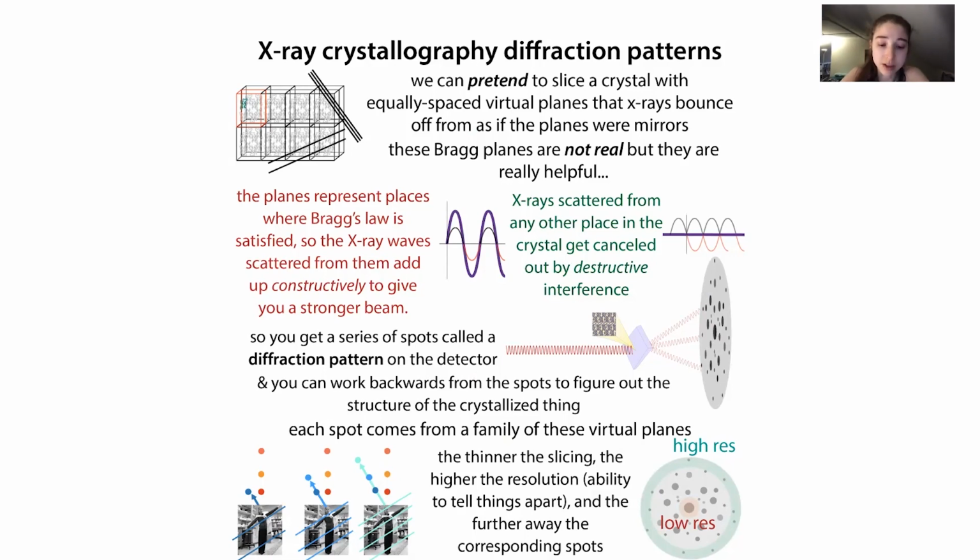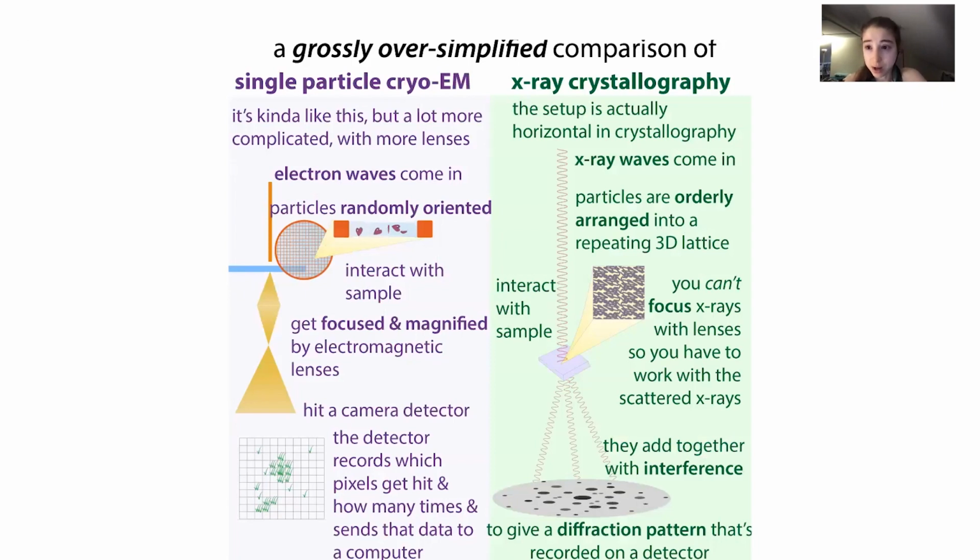And so it's hard to compare directly between the reported resolutions from cryo-EM structures and X-ray crystallography structures. I'm not really going to go into that, but just know that you can't easily compare between the reported resolutions for cryo-EM and for X-ray crystallography. And there's some controversy over how to determine and report your estimated resolution for cryo-EM that I'm not going to get into, but I just wanted you to be aware.